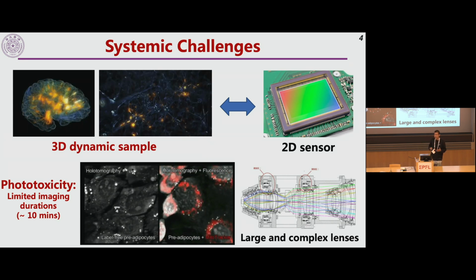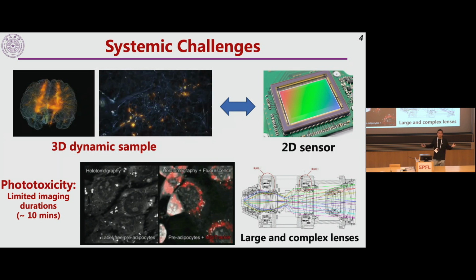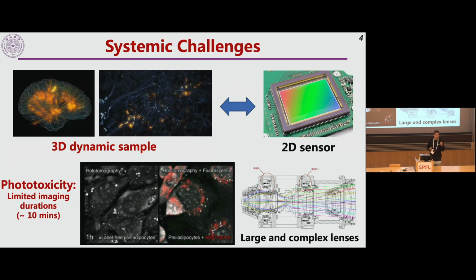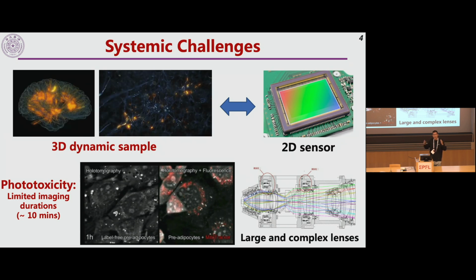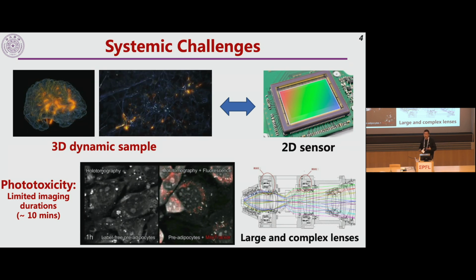There are basically three different kinds of challenges. One challenge is the 3D distribution inside the organ. We do not take the cells outside, as in cultured cell imaging. We want to see the native behavior of these cells inside the organs, how different cells behave. Since it is 3D distributed, we need high-speed 3D imaging with a very high space-bandwidth product. So how do we realize it?